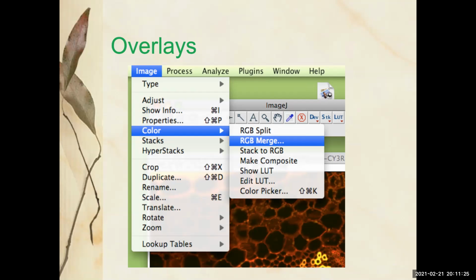Wouldn't that be nice? That would be user friendly. If they had some big buttons that just said, look, if you're in doubt, you don't know, just do these 5 things. Everybody needs to do these things. It's not at all like that. There's the things you do every single time thrown in equally somewhere in there with things that you'll never do. Nobody knows what they are, plus a lot of random things that might be wonderful, but who knows, or are super advanced.